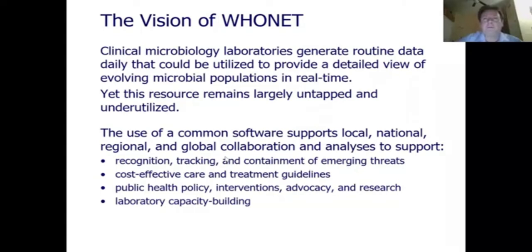Sometimes we find laboratories where the data have difficulties. I recommend collecting those data. If you don't believe the data, do not publish them. Do not put them in your annual reports. Do not report them to WHO if you don't believe them. But if you capture the data, this can be a valuable part of a strategy to improve laboratory capacity through feedback and auditing.